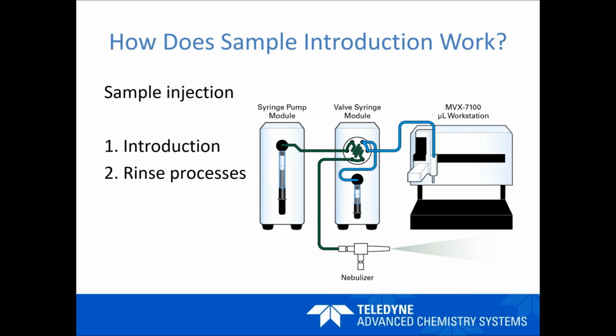And whilst that's happening, the other flow, the flow from the short syringe to the sample needle, will backflush and clean the sample needle on the inside and the outside at the rinse station. So that's a simple sample introduction, and that's what will happen for each sample in a batch analysis. You can be doing this with small, low, distinct volumes in a batch analysis setting rather than doing anything individually.